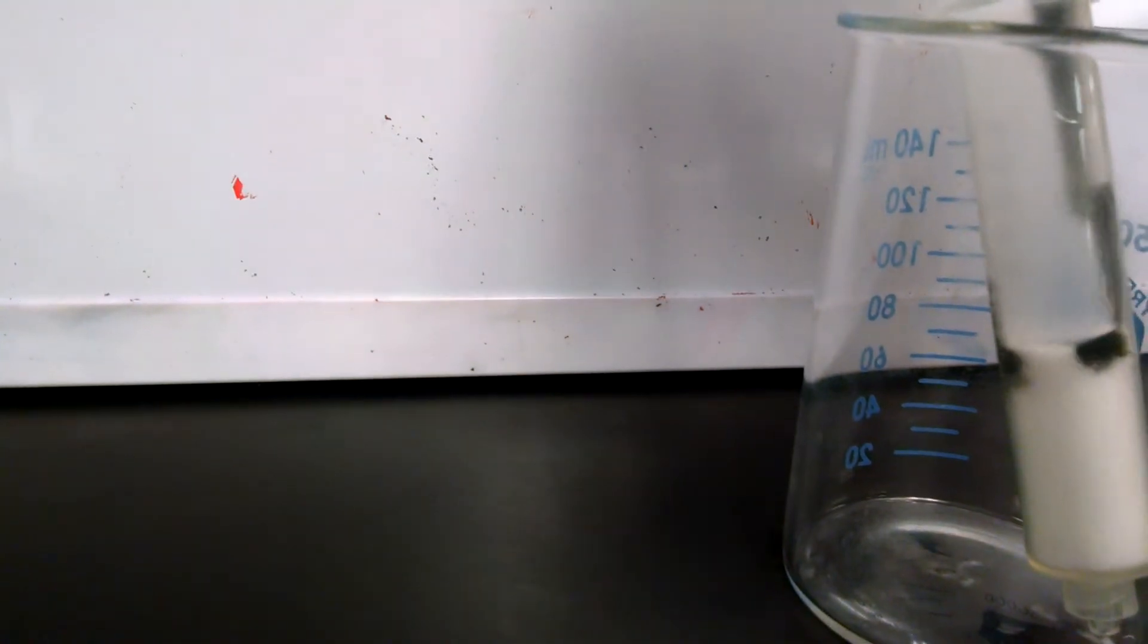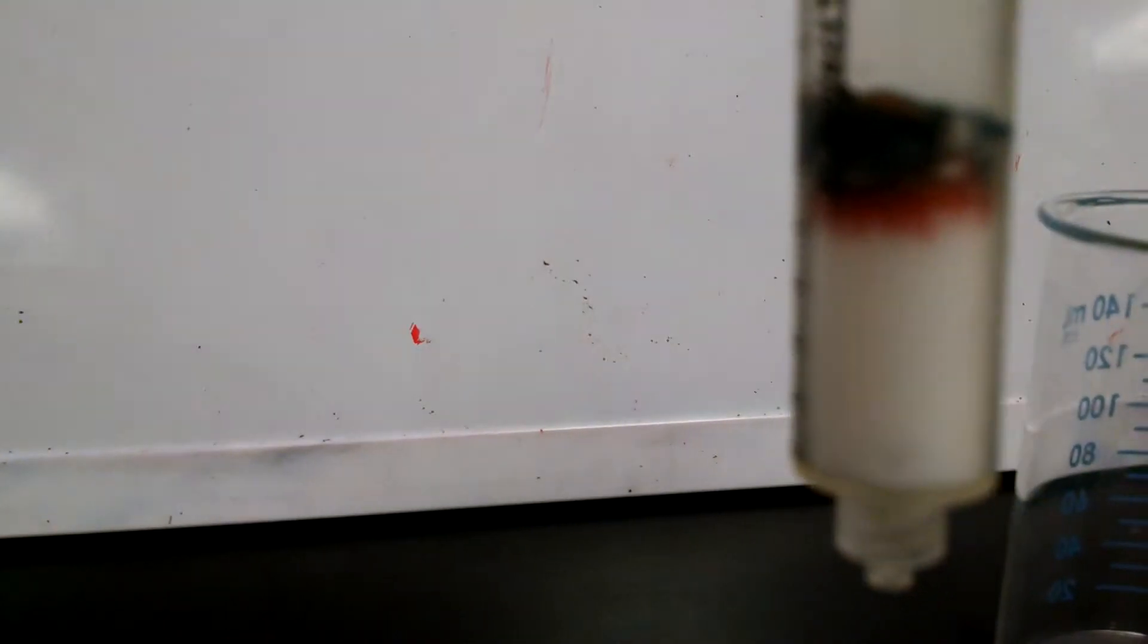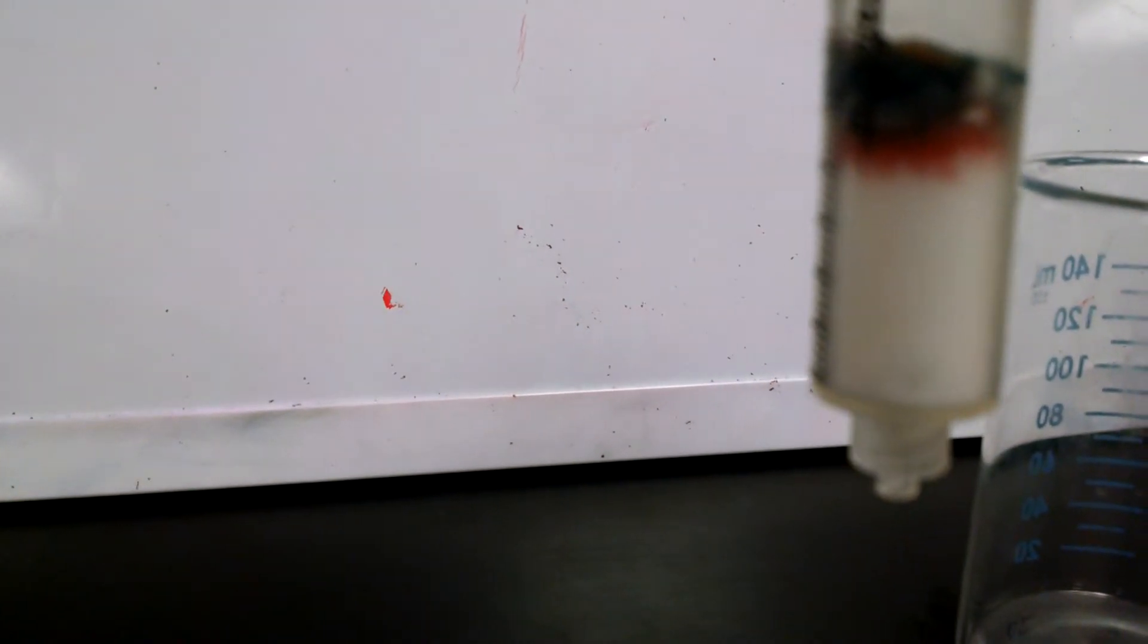So I'll place it in here and then I'll add my Kool-Aid to it and you will notice that the Kool-Aid gets stuck to the column and you'll see that it's starting to separate right there. I'll place it back in there.